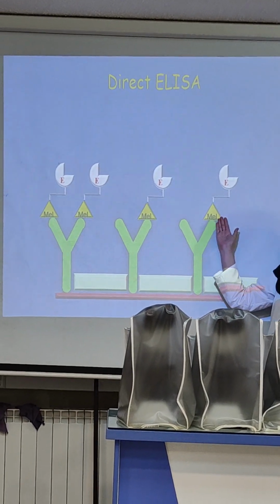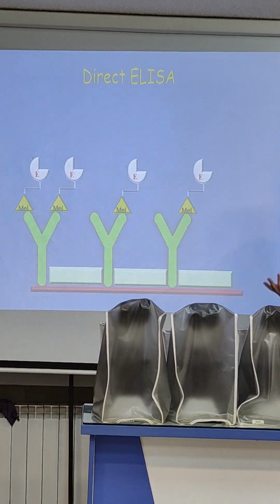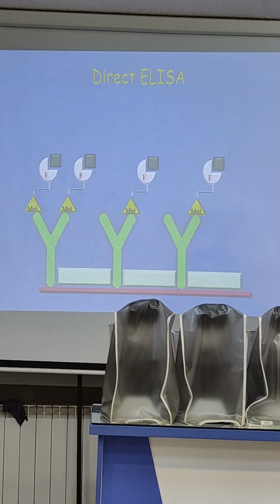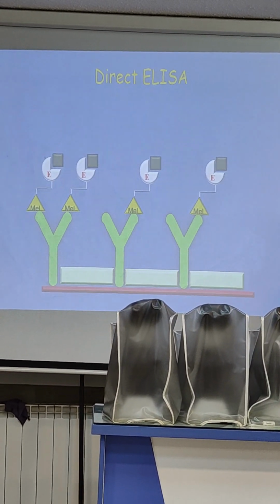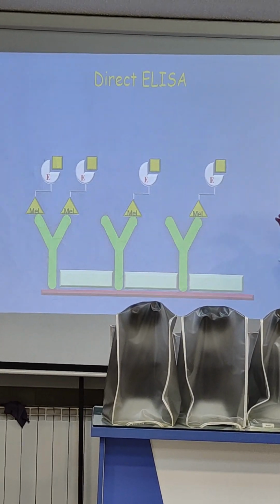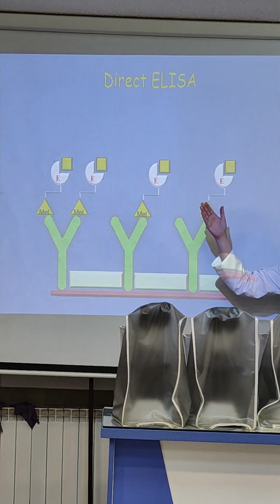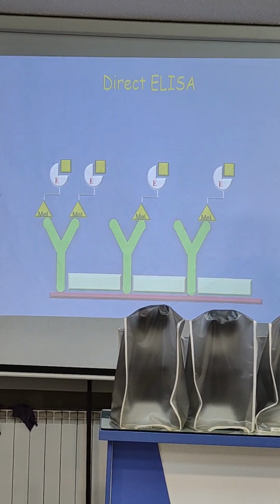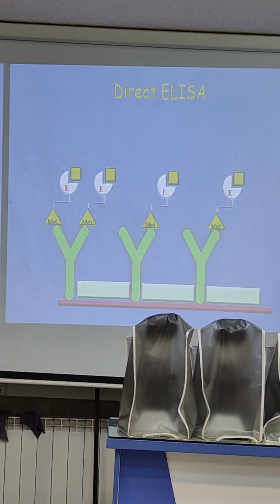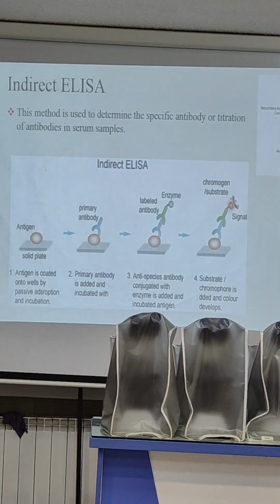You have a formation of the antibodies with the enzyme. Is it detectable? No. You should add a substrate, and you require time for the reaction of the substrate with the enzyme. After adding the stopper, the color is now yellow. And instead of a spectrophotometer, what is another type? It is an ELISA reader. I will compare the spectrophotometer and the ELISA reader. You can read the absorbance of your sample.